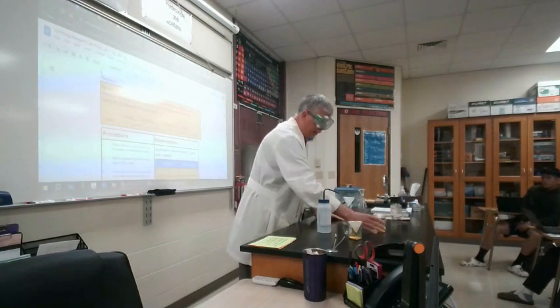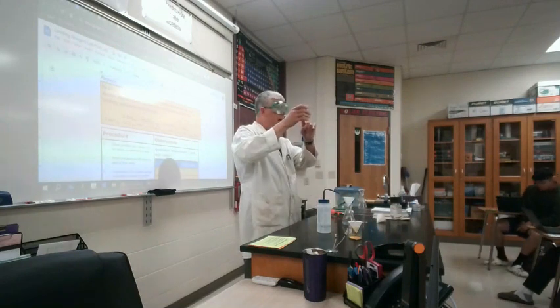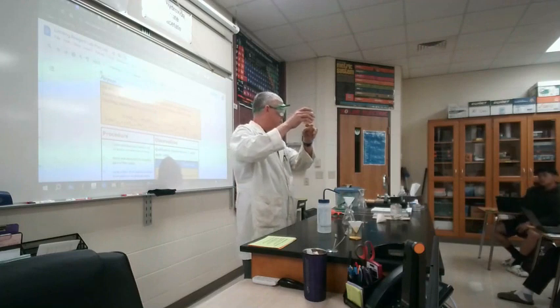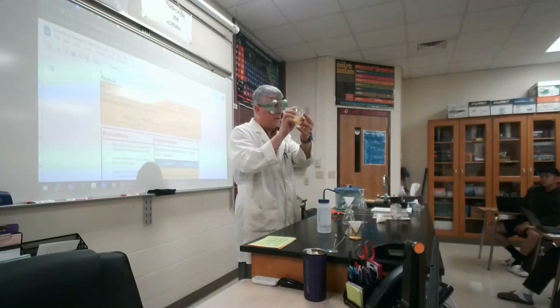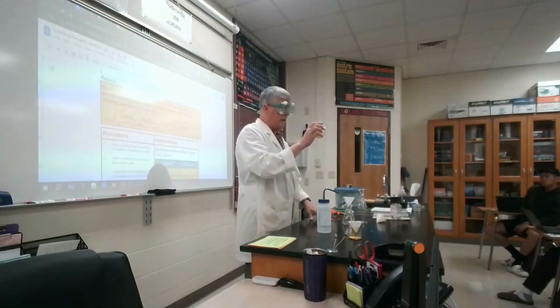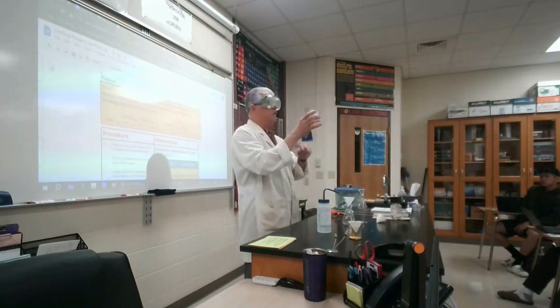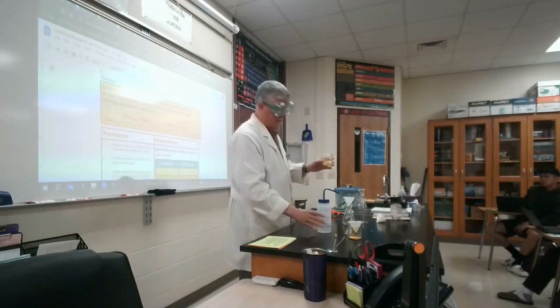When you are pouring it, ladies and gentlemen, you're pouring it and you're watching for all of the heavy stuff on the bottom to start working its way up to where it is going to start coming out. By the way, all of them have a lip to pour with. Pour in that area so that we're sure we hit this. Okay? When the heavy stuff starts to get near the edge, turn it back up. Let it go sit down, sit in the bottom.